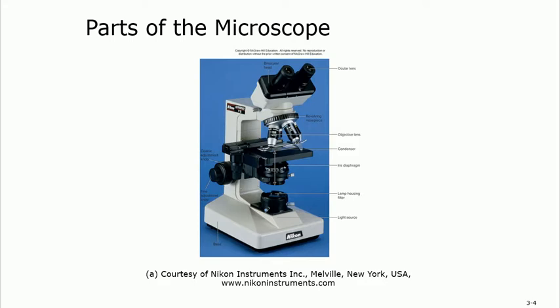The light path starts from the bottom: the base has a light source, then light goes through the lamp housing filter, then through the diaphragm, then through the condenser to condense the light, and it hits the specimen. Then it goes to the objective lens where it is magnified — you can choose one of the four — and finally it goes to the binocular head, where the ocular lenses do the other part of the magnification.